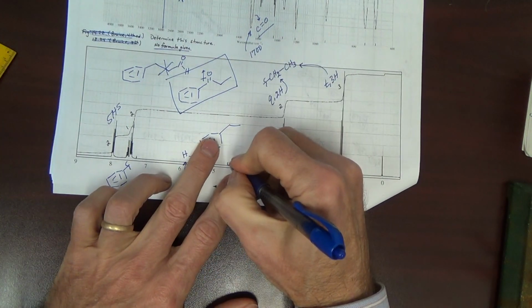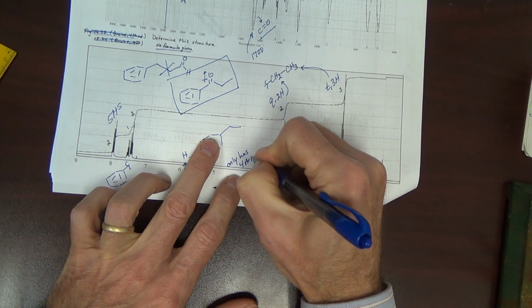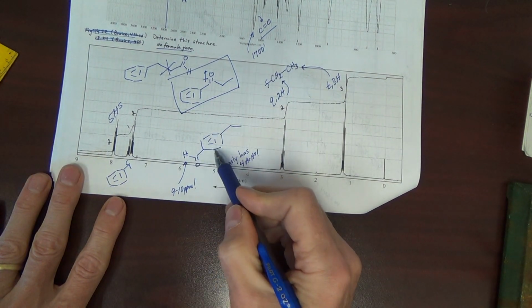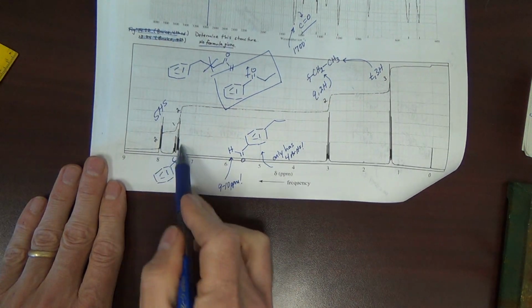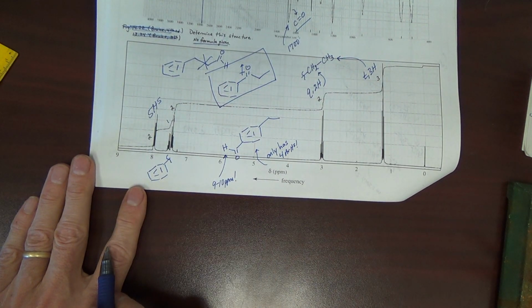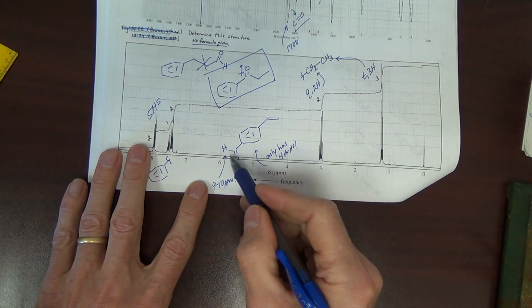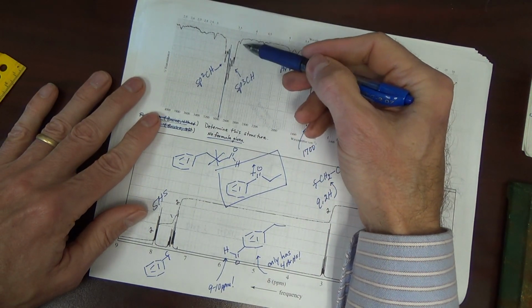This structure also only has 4 aromatic H's: 1, 2, 3, and 4. But the NMR shows that we have 5 aromatic H's. Now you can also see the presence of aldehyde in the IR, and it's really not there.